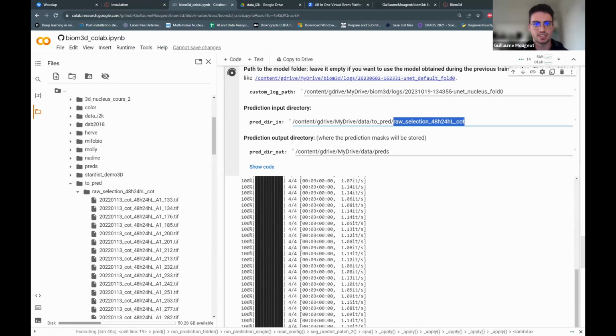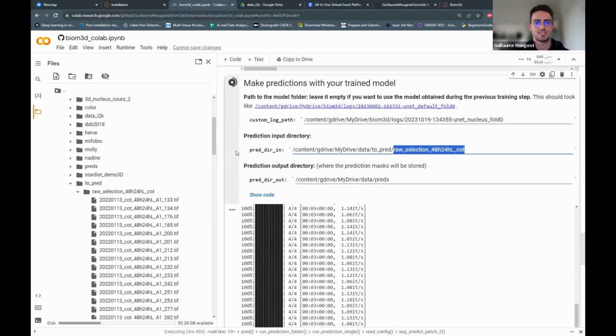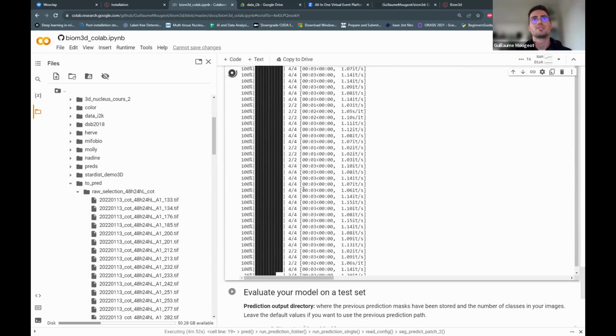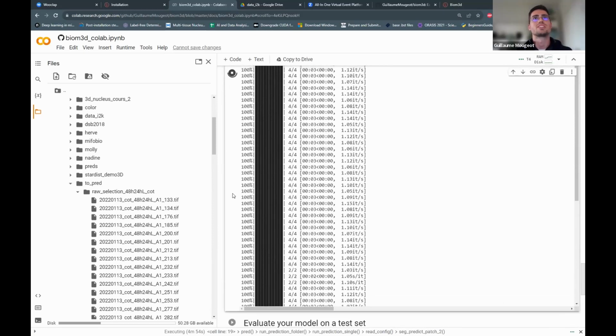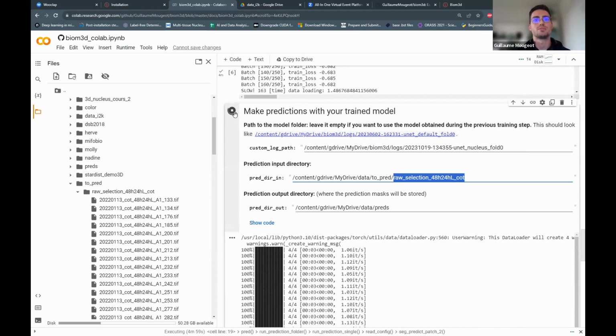Great. Awesome. At least two of you are able to do some predictions. That's great. If you want to go through all of the process, you can just let it go, but you can also interrupt it and restart it when you want.